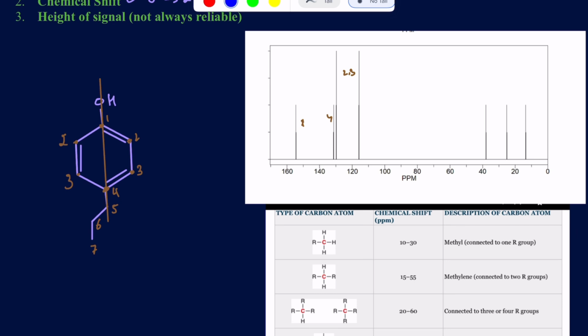It tells you that, okay, these are aromatic. This is going to be twice. So you have two carbons belonging to this signal, two carbons belonging to this signal as well. And then you got three signals that are going to be in the aliphatic region. So aliphatic carbons here, you have from 0 to like 40-ish. And remember, those are going to be the carbons that are just attached to other hydrogens or carbons, because that's what we have in that particular range. The carbon I have here, which is just a CH2, that's 5. This is 6, and this is 7 right there. If I have to relatively talk about their shielding, 5, since it's going to be right next to the double bonded carbon, or I can say aromatic, 5 is going to be the most deshielded out of those 3 carbon atoms.